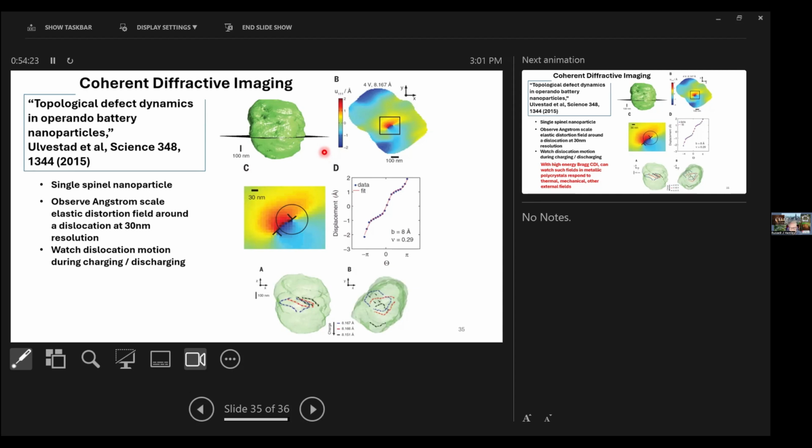Great. Yeah, that higher energy range is also very important for diamond cell samples because we need to be above roughly 20 keV for good measurements in a diamond anvil cell. Yeah, very good point. Yes.